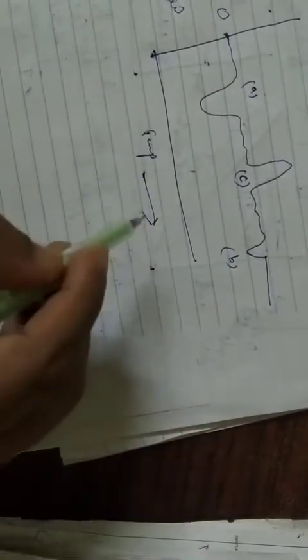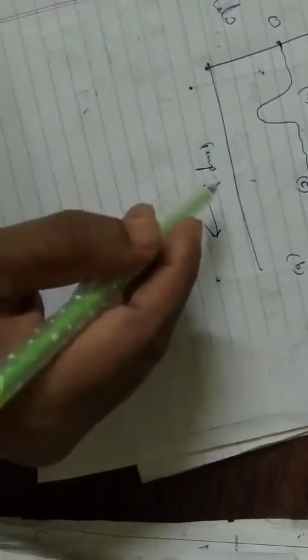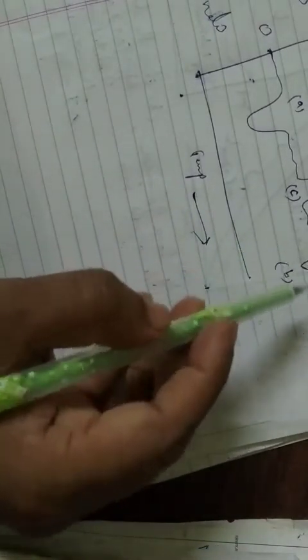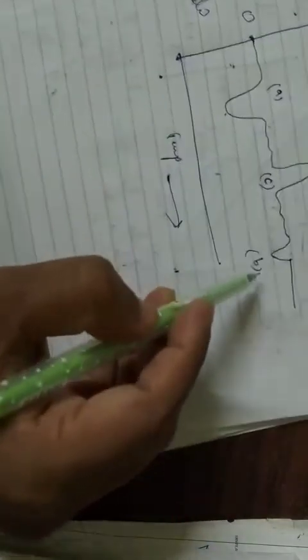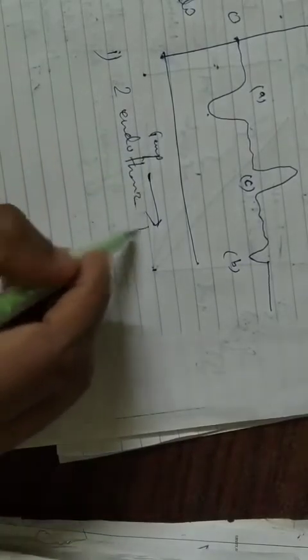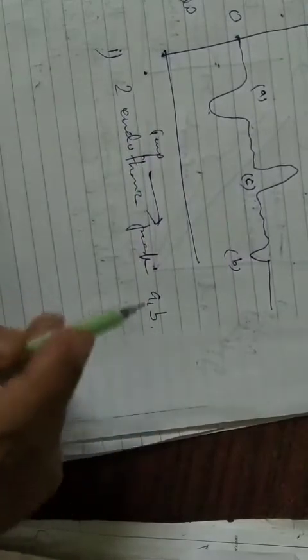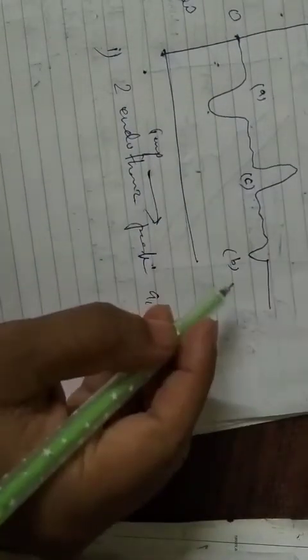Now this is temperature as we increase. Here the graph is giving two endothermic peaks, A and B. You can see the downward peaks, that is your A and B, okay. So two endothermic peaks you are going to observe here.